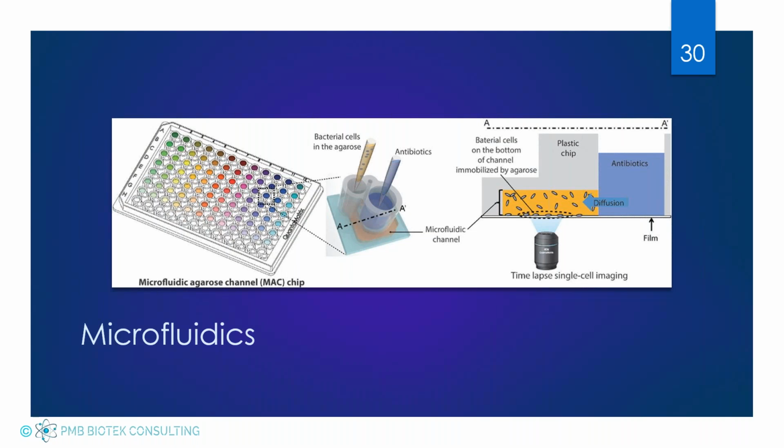And where they're really neat is that there's not a lot of capital equipment. This can be done on biochips. They can be done in very small, portable, handheld devices. So this is something that you could, in theory, take to your grow facility and do testing on site there, or you could potentially do same-day testing on samples, because the detection limits can be very low with these. We do tend to see some matrix interference issues, so that's the biggest hurdle that these companies are having to overcome.